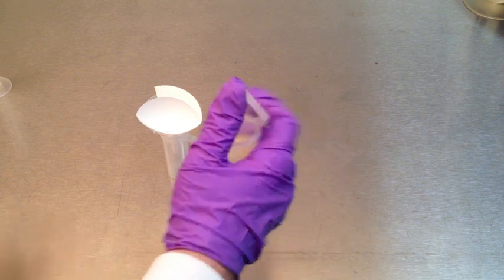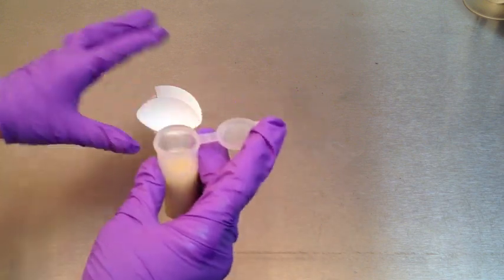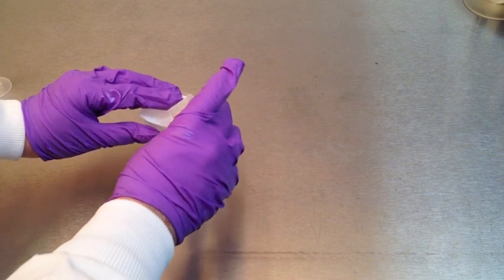Using the filter paper, a funnel, and a clean extraction tube, filter the extract into the clean extraction tube.